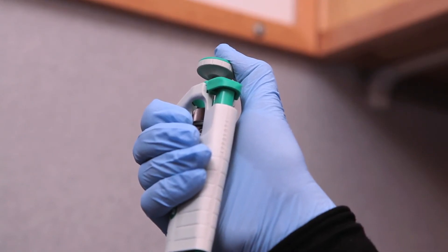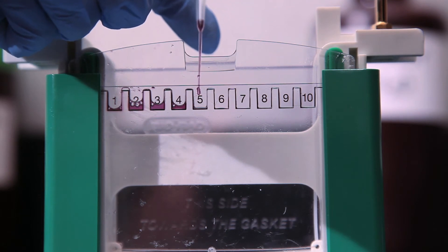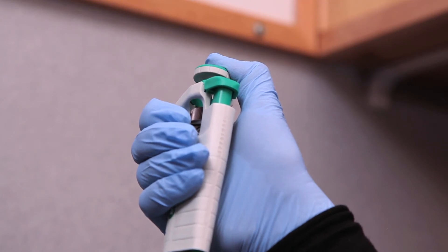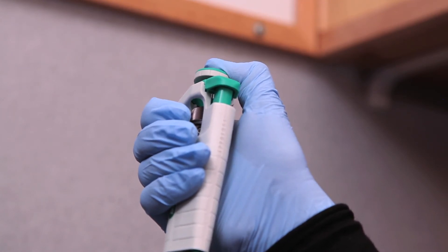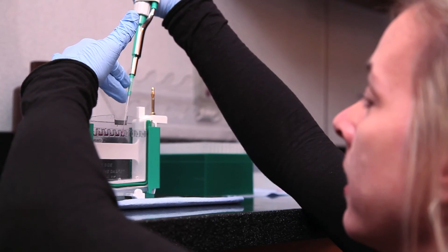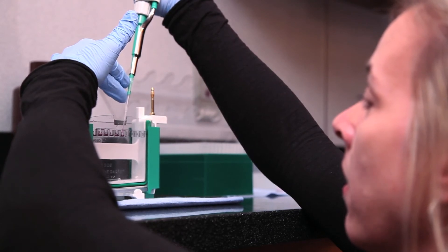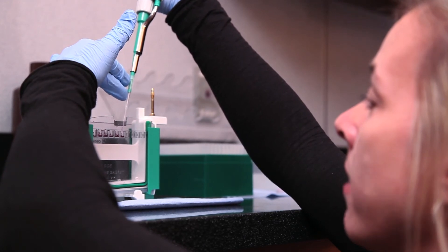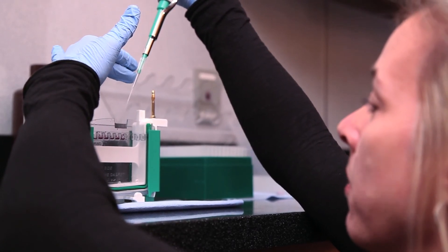And then I'm going to press my thumb to the first stop to release the contents of my sample. And then I'm going to keep pressing all the way to the second stop to completely release my sample. And then I'm going to hold my thumb on the second stop as I remove the pipette tip from the gel.